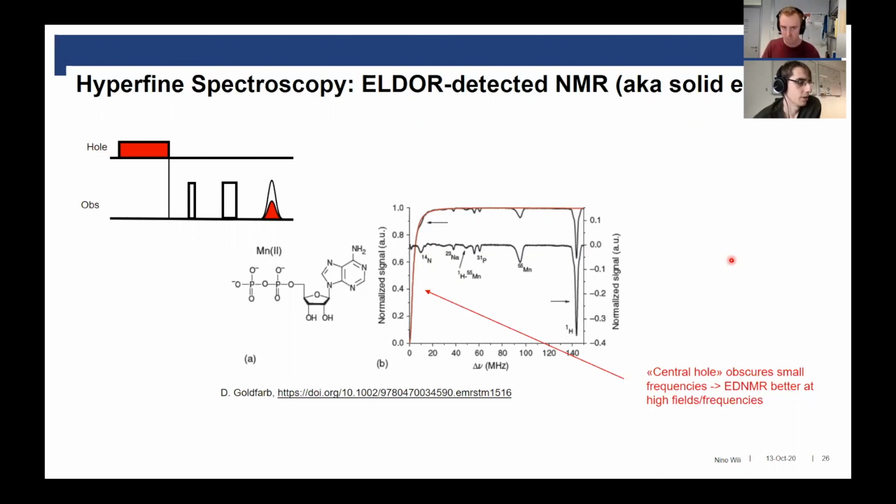You mentioned orientation selection again. An anonymous attendee asks, are there any applications where you combine orientation selection media, so alignment media used for residual dipolar couplings in NMR, to align your EPR and use that orientation selection? I think there is. I think Jack Fried looked at it, but mostly dipolar couplings, in bicells or not.